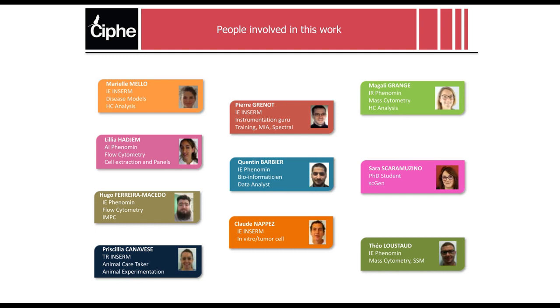Let's get started. Our first question is, how do you deal with license management and training at the level of a consortium?